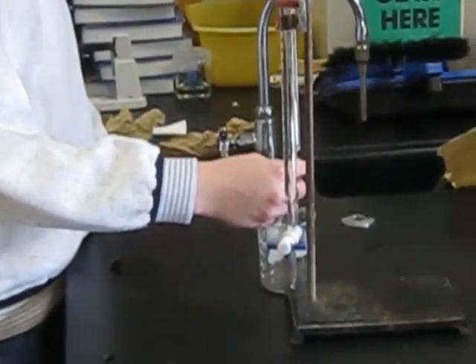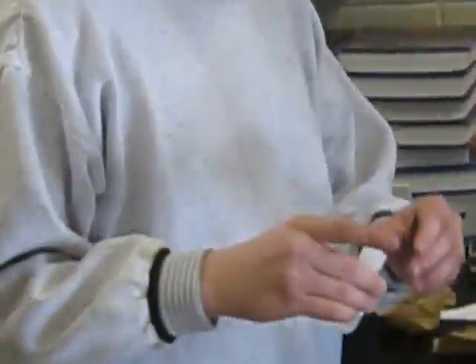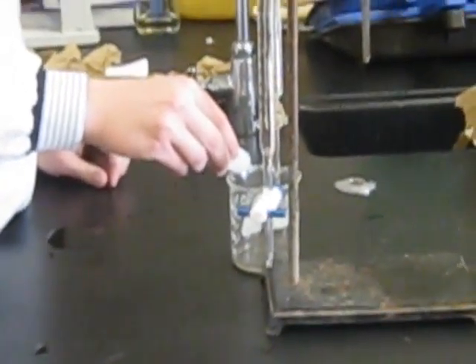So now that he's added in the acid, what he's going to do is add in 3 drops of our indicator, phenolphthalein, in the little bottle there. And what that'll do is change the color of the acid once we've added the proper amount of base to neutralize it.